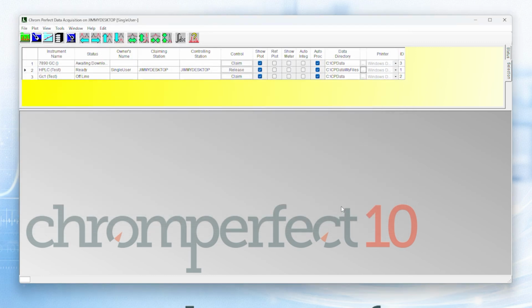Also note the Show Plot checkbox on this screen. By default, this option is enabled. If this box is unchecked, the chromatogram plot window will not appear during acquisition. If you do not see a plot during a run, verify that this option is selected.